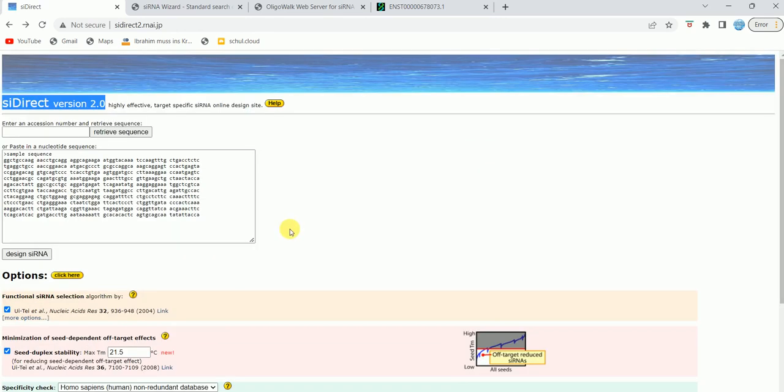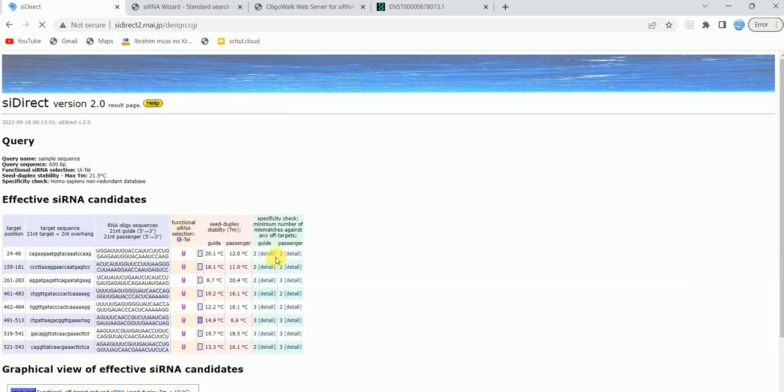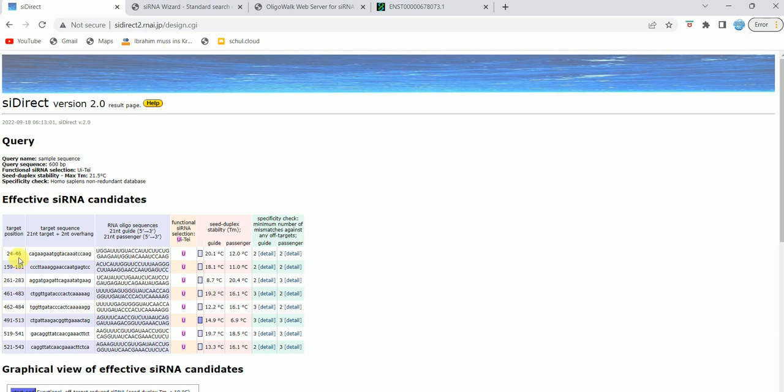What I'm going to do now is just click on design siRNA. I'm not going to select any of those options, but you are more than welcome to choose the options to suit your requirement. When I click on design siRNA, it now shows me the list of effective siRNA candidates. As you can see, it has given me the list of siRNA candidates—basically one, two, three, four, five, six, seven, eight candidates. It also shows the oligo sequence, functional siRNA selection, Tm values, Ui-Tei and seed duplex temperature, and all these details.